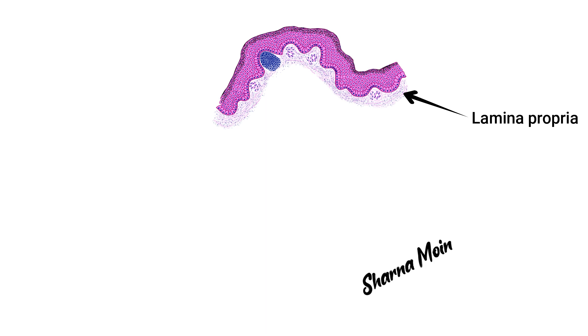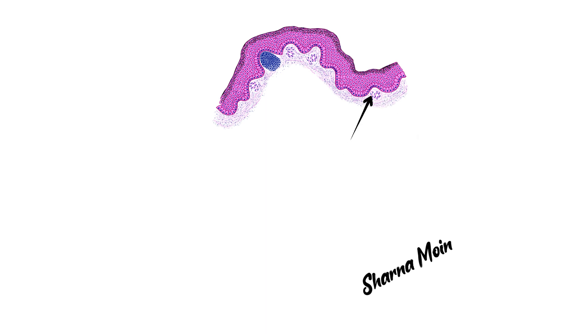Then we have the lamina propria. It is a connective tissue layer. You can see these blue dots — they are the nuclei of the connective tissue cells. As this is a connective tissue layer, it has connective tissue cells, connective tissue fibers, and you can also see many blood vessels: the arterioles, the venules, and I can also see a lymphatic nodule here.